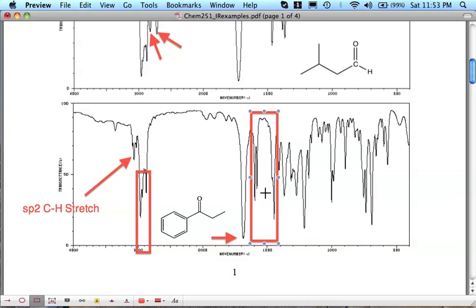There are a couple other things to mention about the aromatic, although I'm not going to have you identify it normally. Typically, you'll have some aromatic CH vibrations down here, and they're usually fairly intense around this 700 region, 700 to 900, something like that. Again, normally it's hard to tell because you have a lot of things coming down in this fingerprint region.